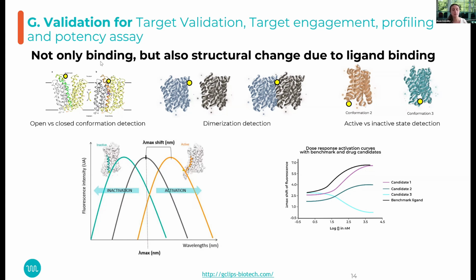So here, for example, I represented a transporter where we have put it on the extracellular part, and we can then monitor the opening and closing of this transporter. You can also put it on the interaction interface between 2 proteins that can dimerize and detect dimerization or splitting of the complex. You can as well use it on a G protein coupled receptor.